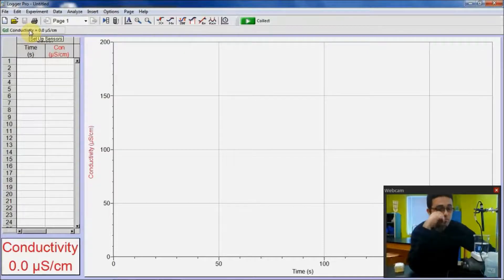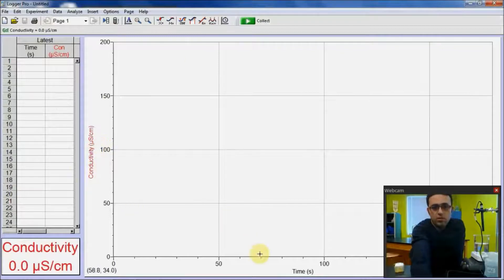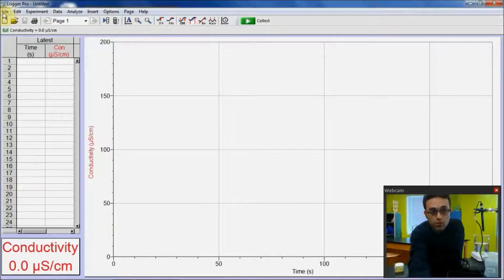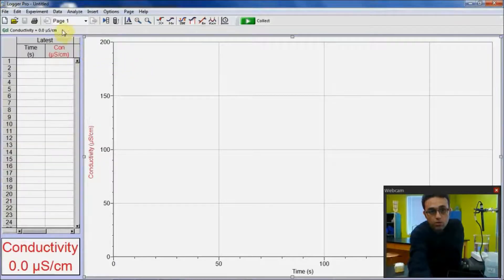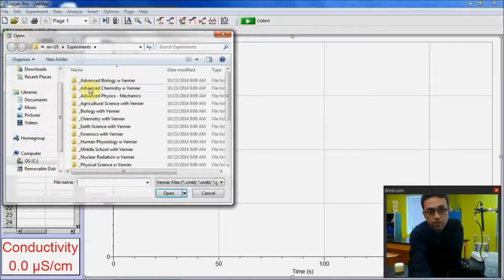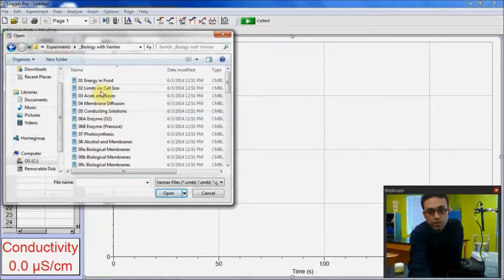the software recognizes the conductivity probe here. And you can use this setup for conductivity versus time. But there is a preset setup for this particular experiment. So you either go click on this file and select open, or you click on this. So it will open the experiment files. You will click on biology with Vernier and you will select the limits on cell size.